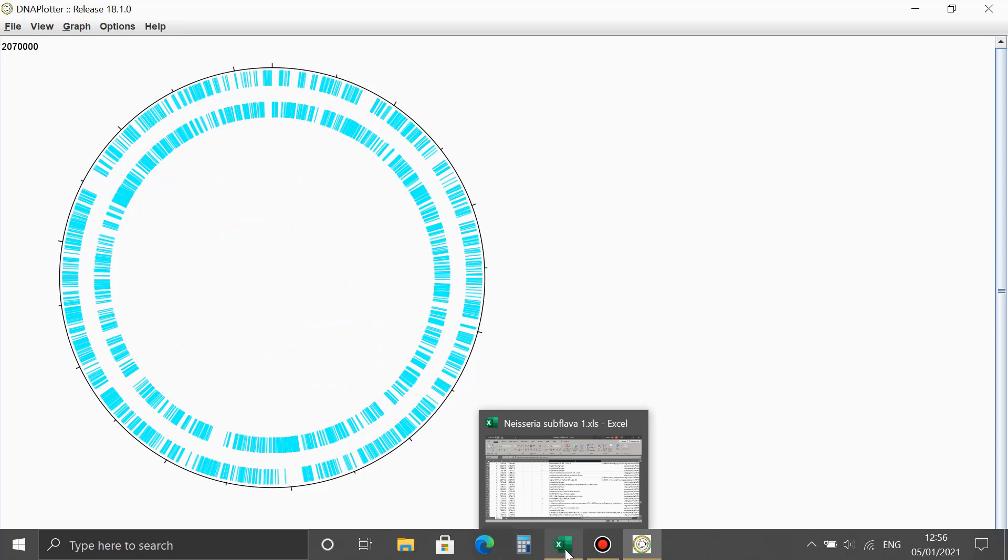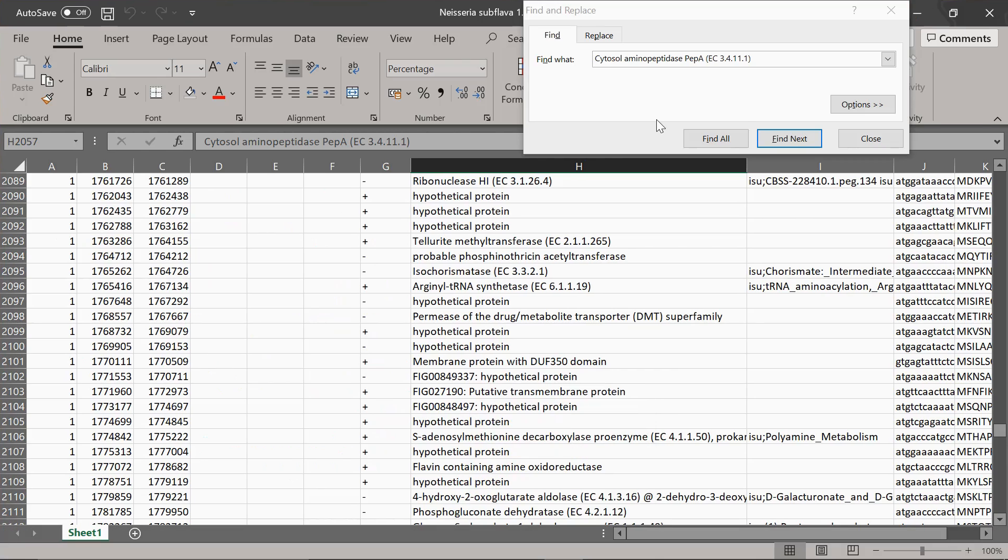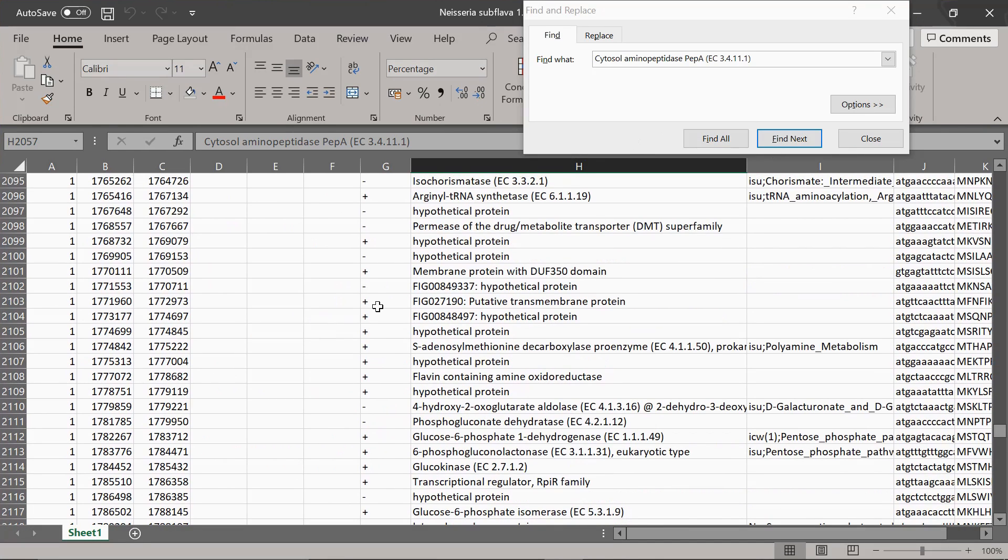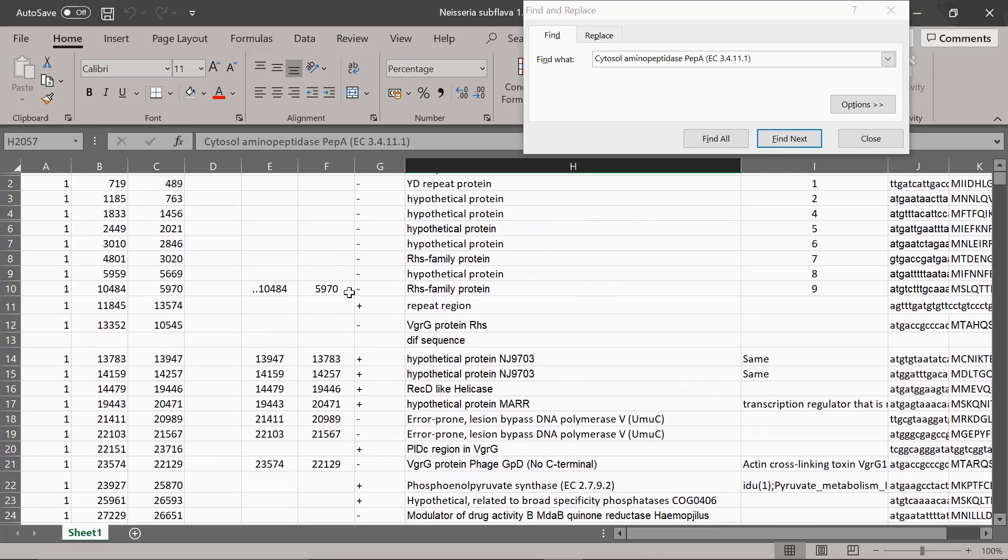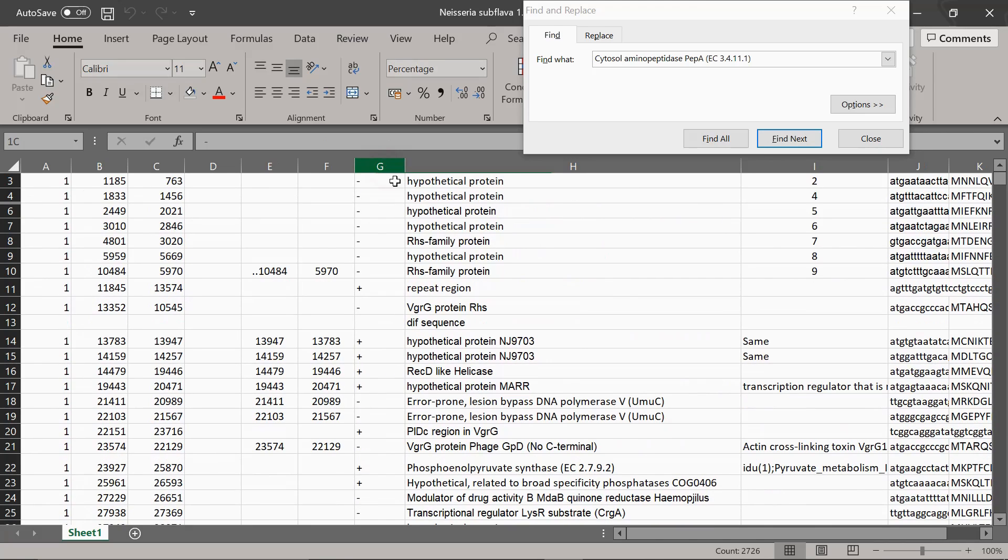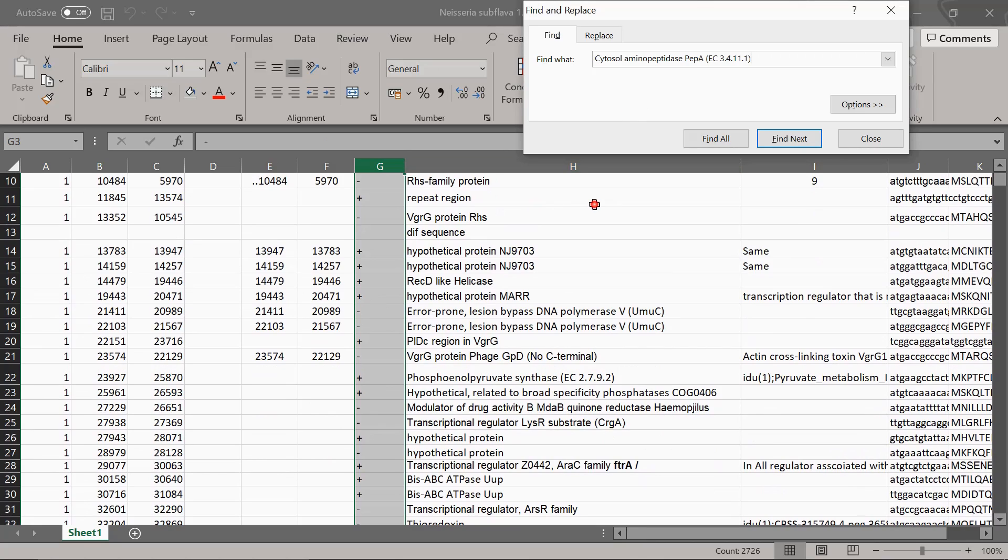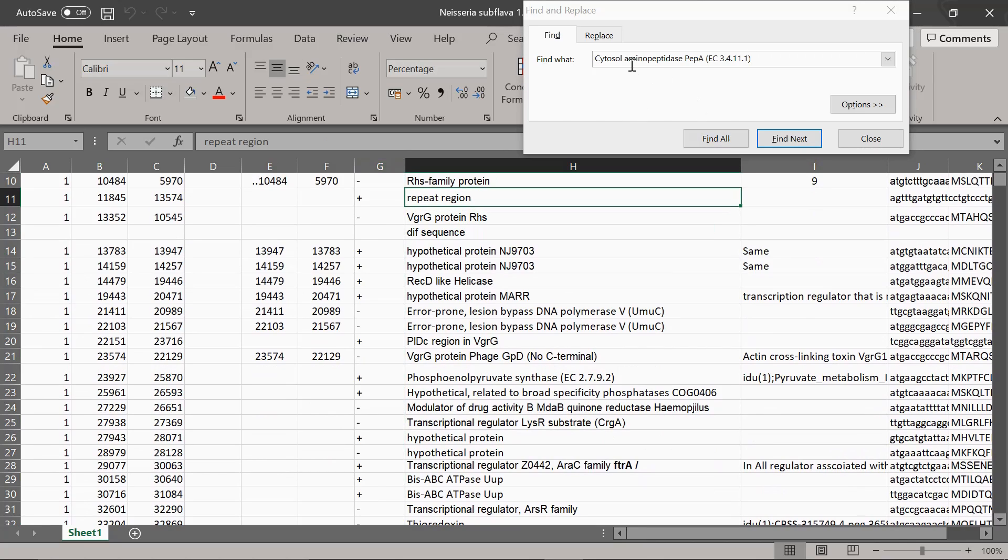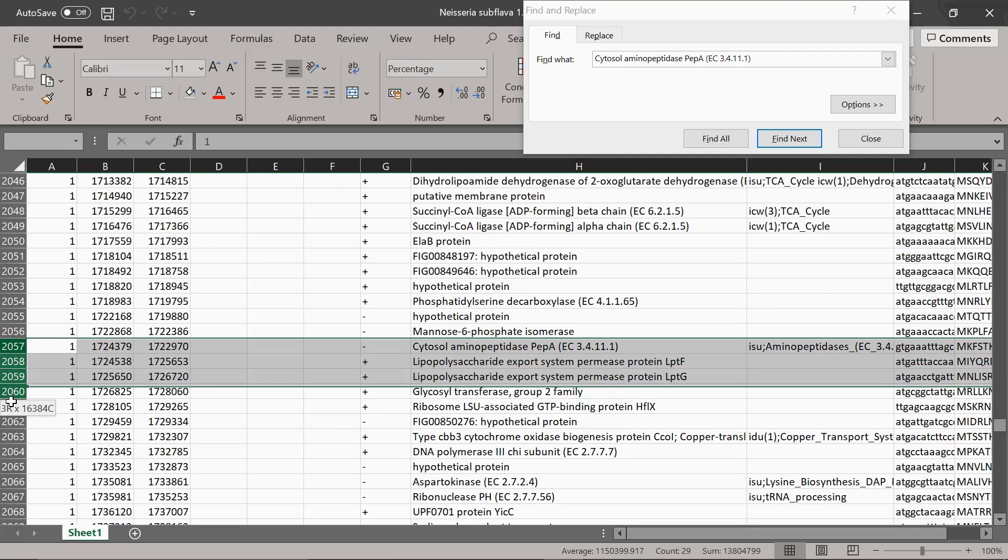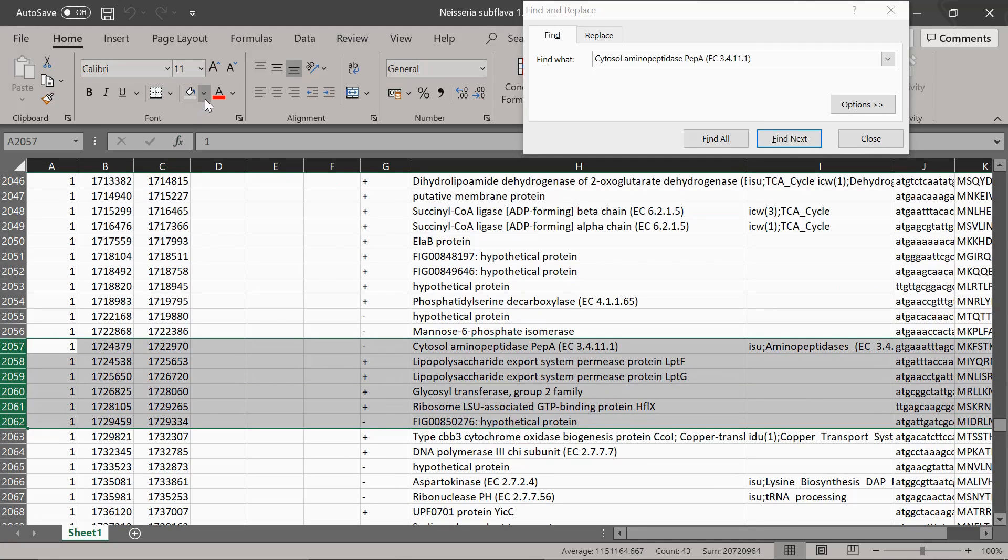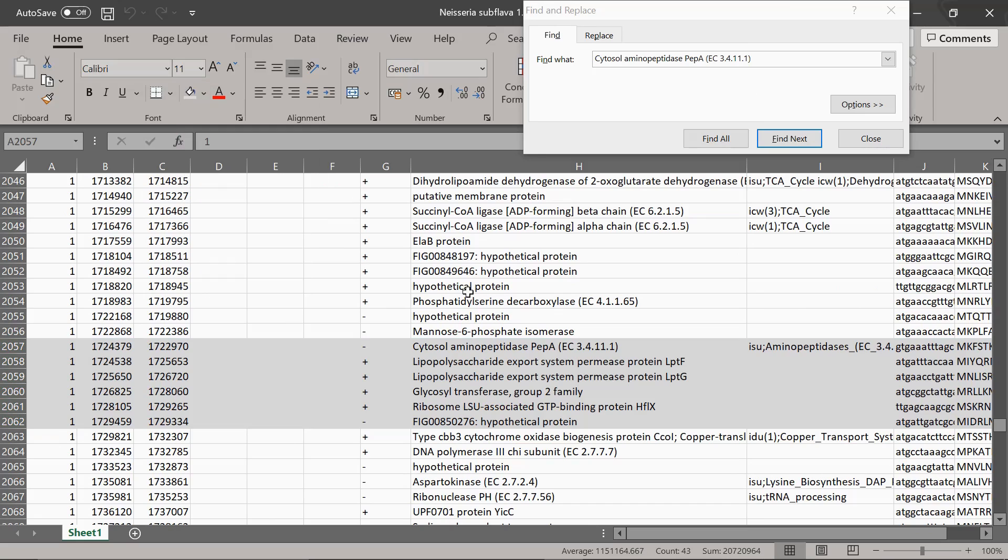The next thing to do is I'm going to open up my Neisseria subflava Excel file. And I've selected a region of the genome that I want to represent on that circular image. As you can see here, the start and stop coordinates of the gene. Additionally, in this column here, you can see whether it's actually on the forward or reverse strand. I've decided already, and I'll just bring it up, that I want to look here. Cytosol aminopeptidase or PEP-A, as it's been predicted to be. If I just find where that is, I'm just going to look at this cluster here, cluster of genes. I'm just going to highlight that for a minute.